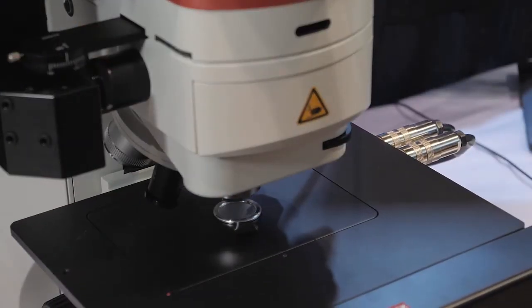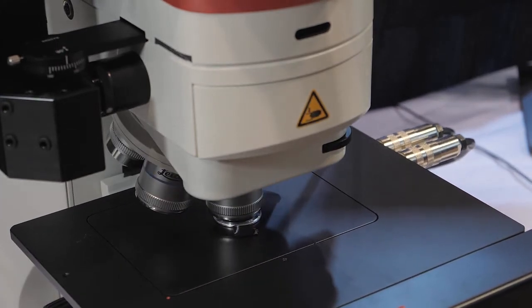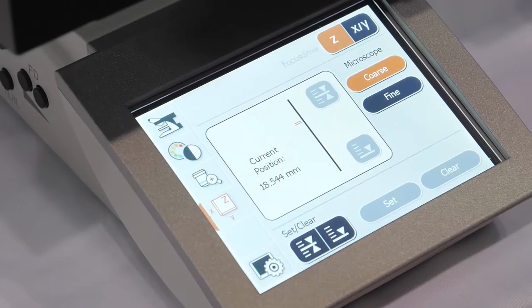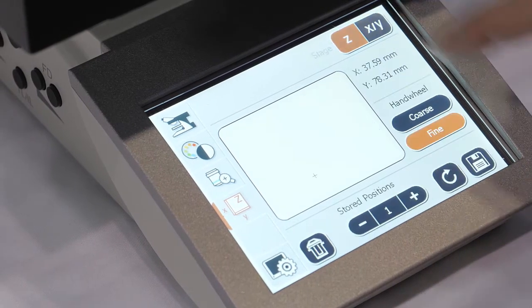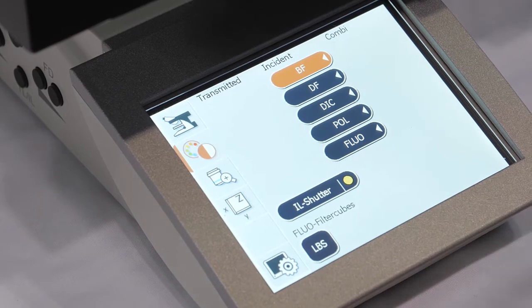It's very simple to use. The primary purpose of this tool is to give you an optical image and also elemental analysis with no sample prep and without the use of an SEM. So I'll run through a very quick demo.